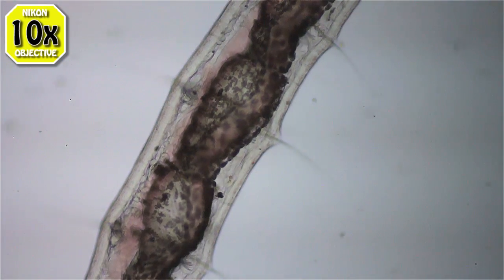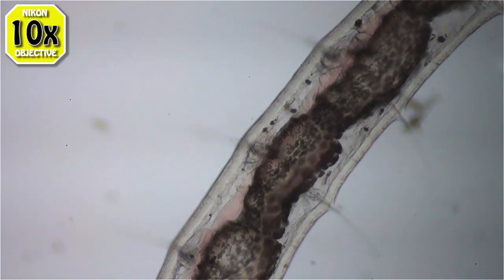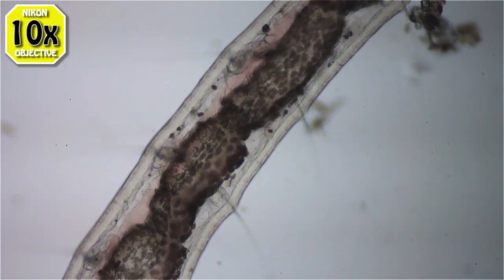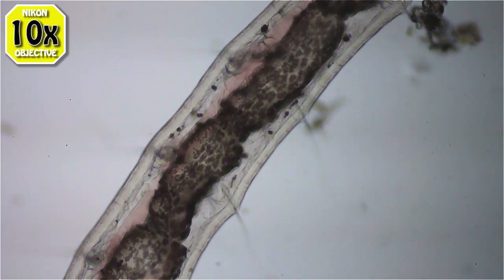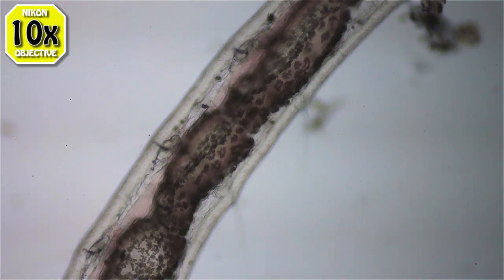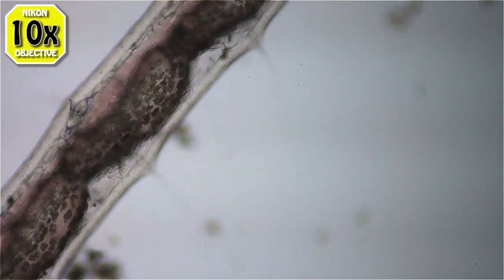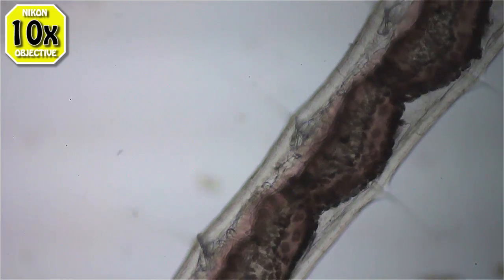I love watching these things. I don't know enough about them though, like what are those little black things on the intestine. What are the things inside the body tube running down on both sides there, are they nerves or what?